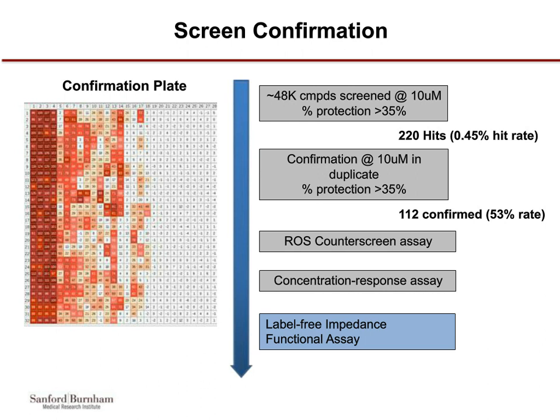And then we are taking those scaffolds and reordering the powders and very close analogs to run concentration response assay. And then we'll move actually away from the ATP viability readout into a label-free assay, which I'll talk about in the next slide.